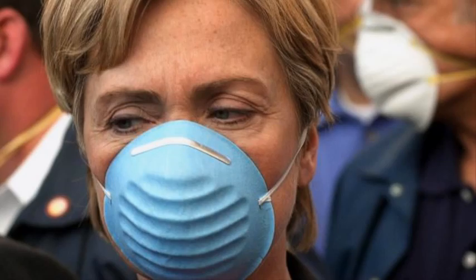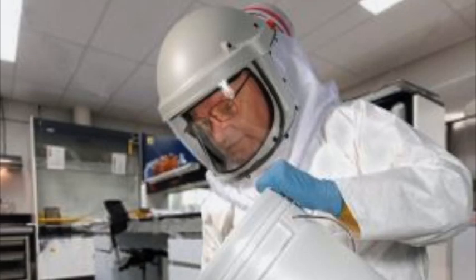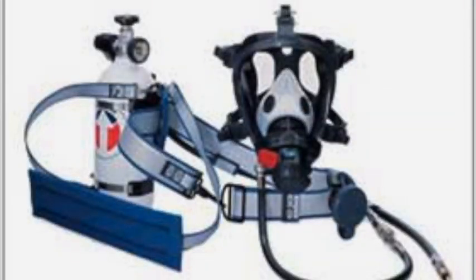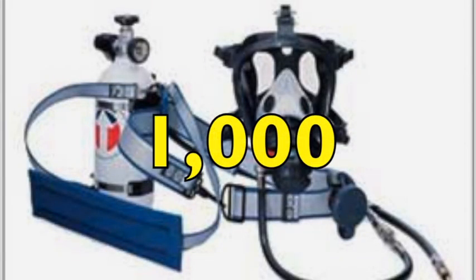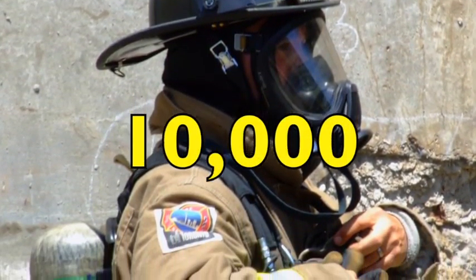A filtering face piece or dust mask is 10. A half mask is 10. Full face is 50. A PAPR loose-fitting helmet hood is 25. A PAPR tight-fitting full-face piece is 1,000. The SAR full-face piece with a pressure demand is 1,000, and the SCBA full-face piece pressure demand is 10,000.